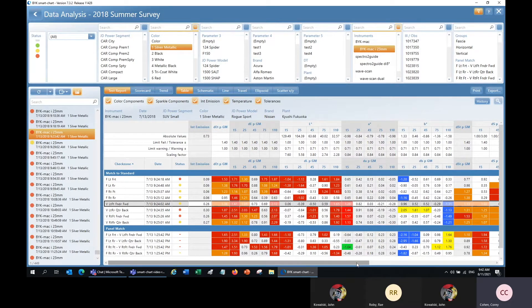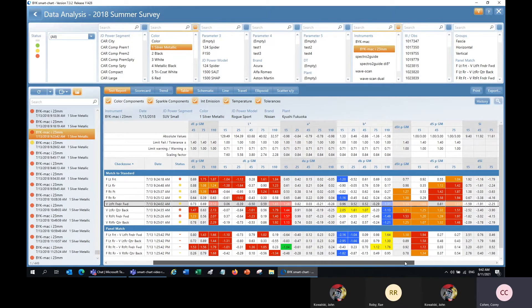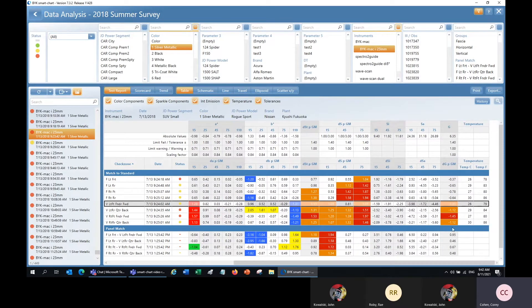When we get to the delta sparkle and graininess values, those will again be highlighted in red or yellow depending on the traffic light signal, which tells us whether they're out of tolerance or not.